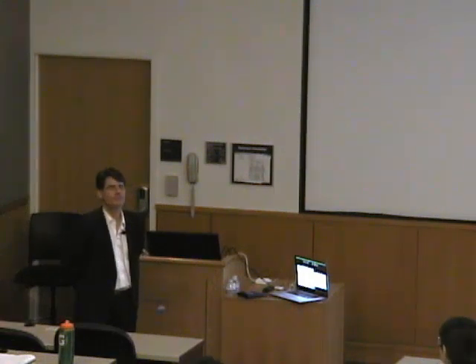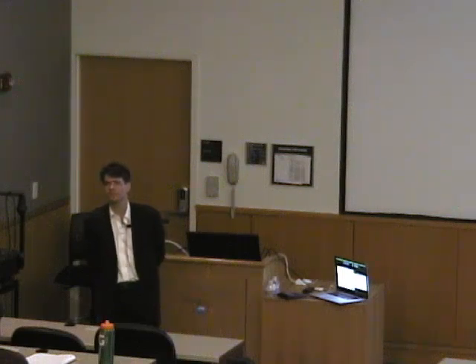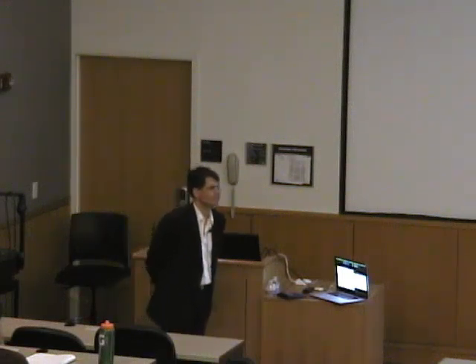This is probably a silly question, but for the C terms, where the intensity is arising from the splitting of the ground state, is there a reason you don't also see a small energetic shift for the C terms, like you do for the A terms? Yes, basically every C term has a tiny bit of A term component in it. It's just totally drowned out by the fact that the C term mechanism is a couple of hundred times stronger than the A term mechanism. Then it's completely correct.